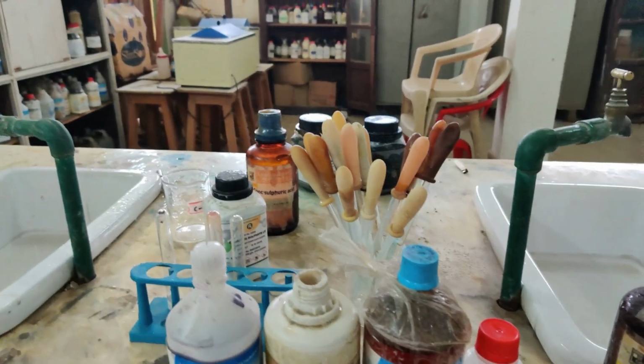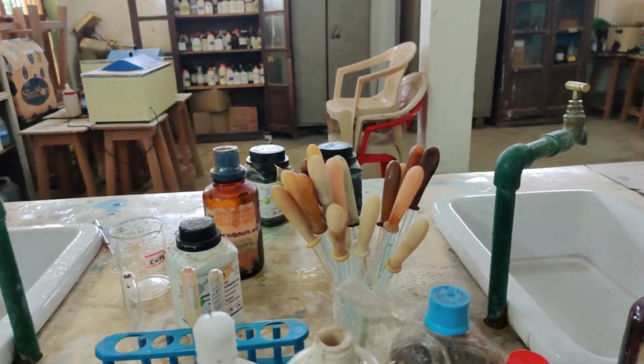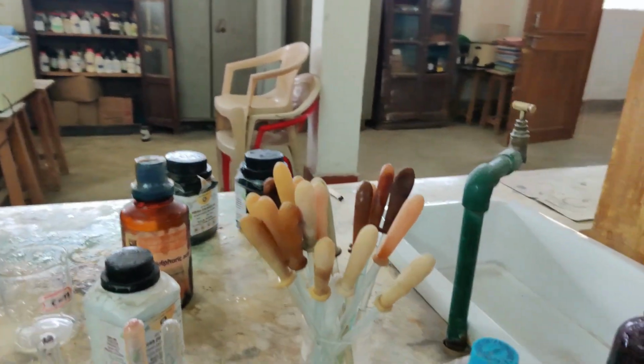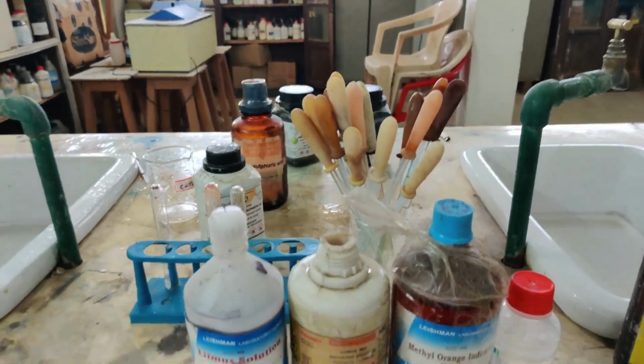I am going to show you today by testing acids and bases how they respond, and what color changes are seen when an acid or a base is tested. So let us first talk about only your common indicators. Now here are your common indicators.